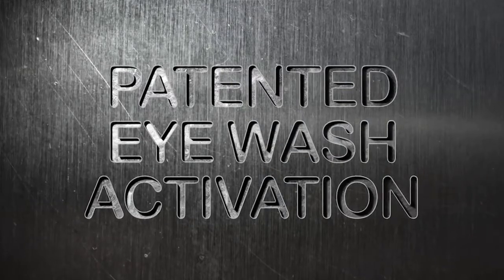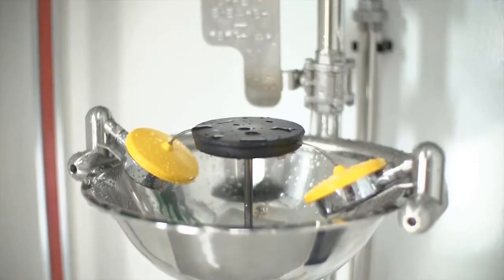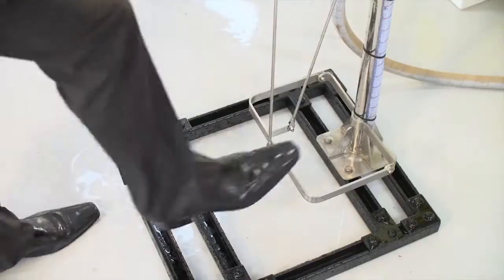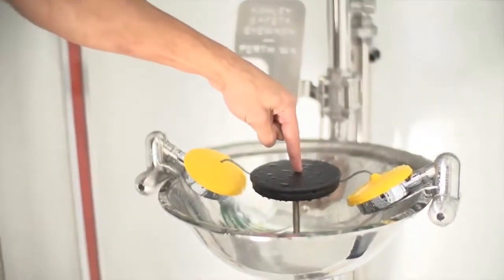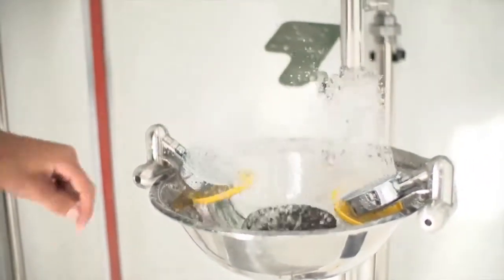Patented eyewash activation. Ashley's unique design for activating the eyewash is revolutionary, and three methods for activating the eyewash are now available: foot pedal, hand pedal, and the patented push button. The push button may be activated by hand, finger, elbow, or head if required in an emergency.